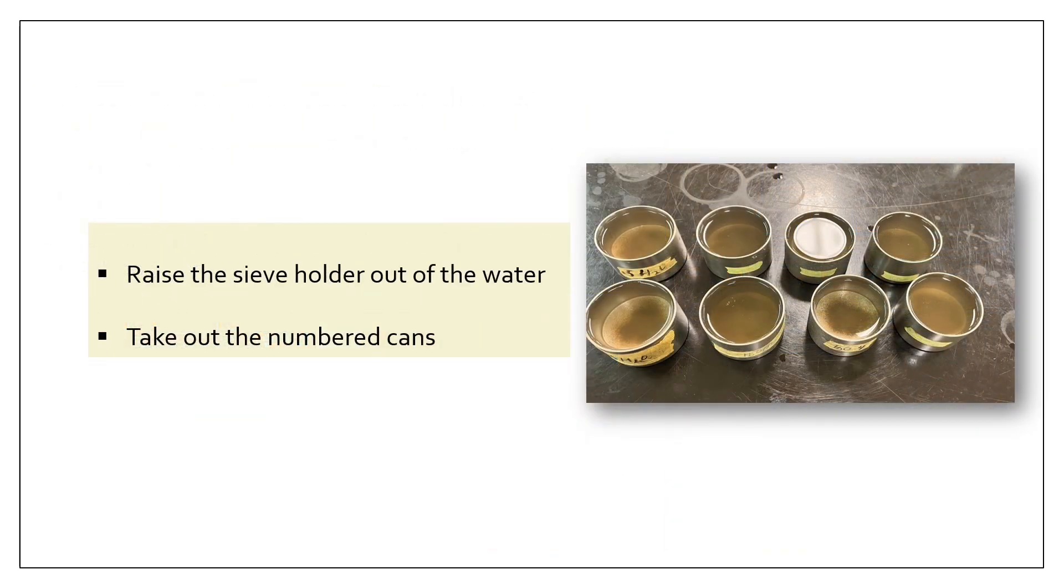After the motor stops, raise the sieve holder out of the water and place it in the leak out position by putting the sieve holder in the first hole of the shaft. When there is no water leaking out of the sieves, take out those cans. These cans now contain the water plus some aggregate fragments that passed through the sieves.